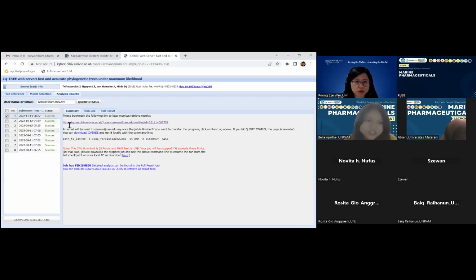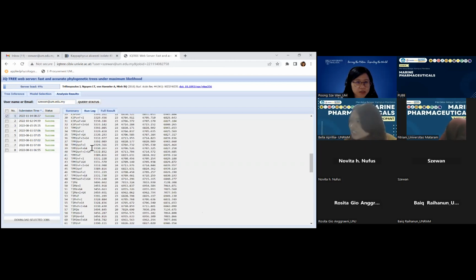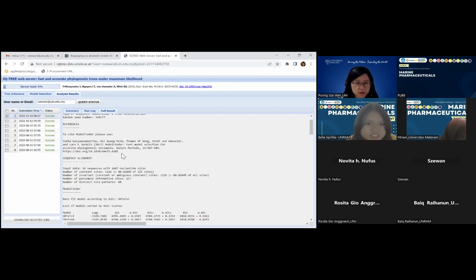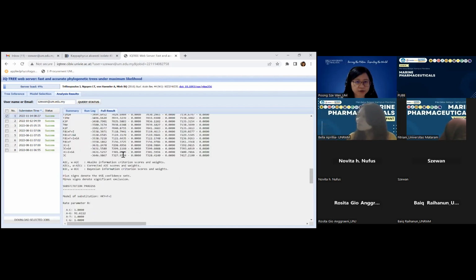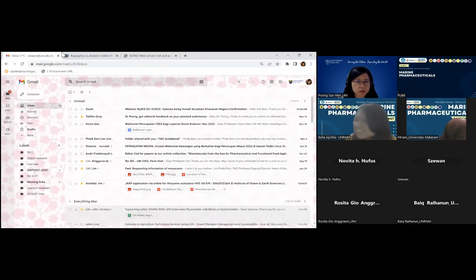Okay, so let's see, run log. I think it's already finished. Or is it? Let me see. Full result. Yes, it's already finished running. So you should receive an email telling you that the result is out.